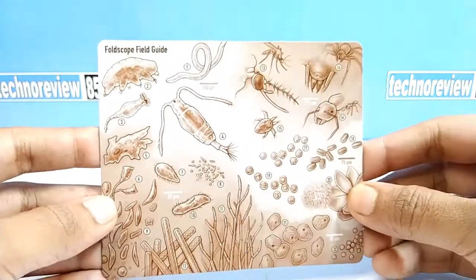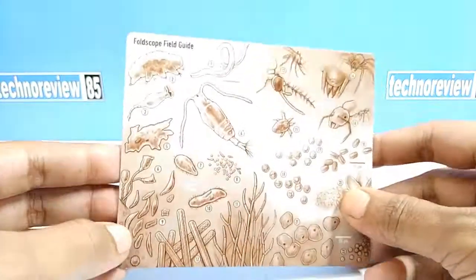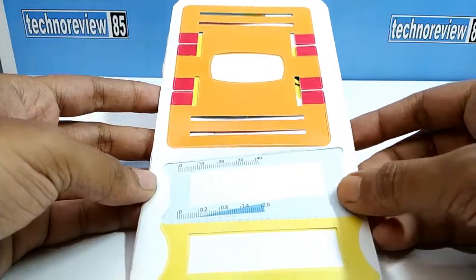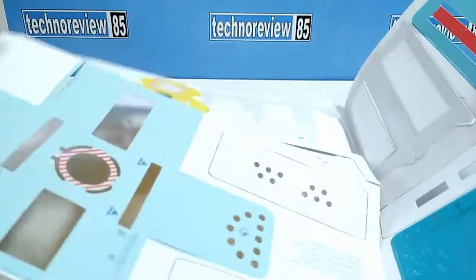Using this magnetic mount you can attach the microscope to your smartphone. Here are some sample images, and on the back side there are explanations about what you can see using this microscope. This is the main body of this microscope. Actually it is not made by paper — it is a durable plastic sheet.